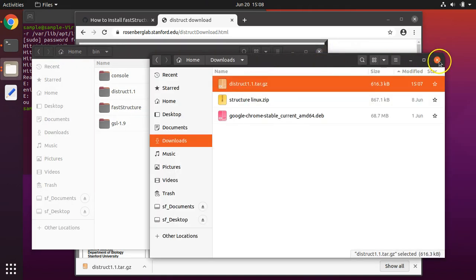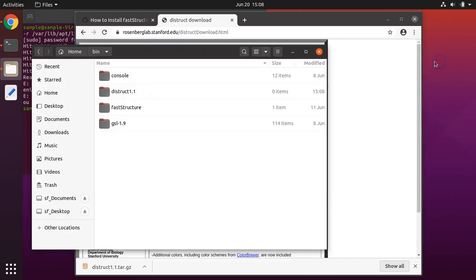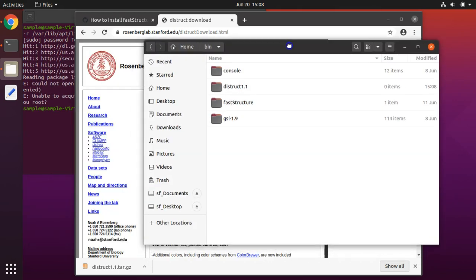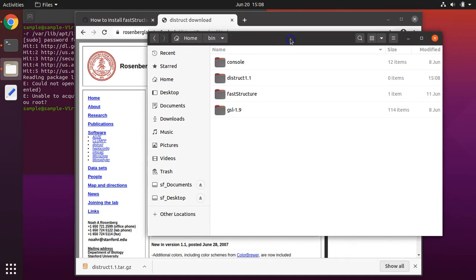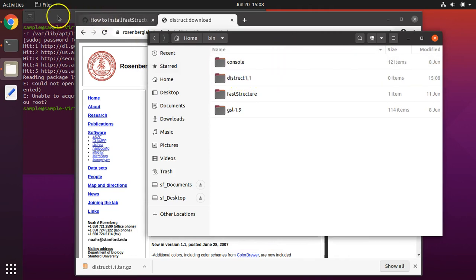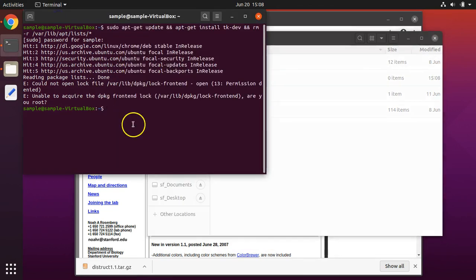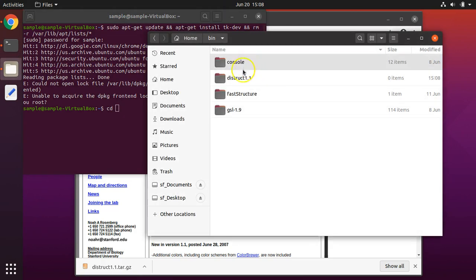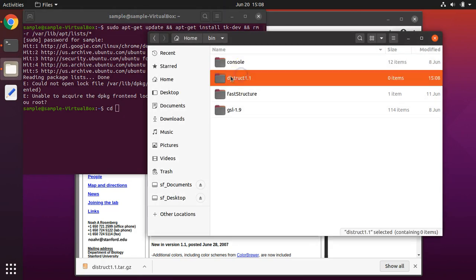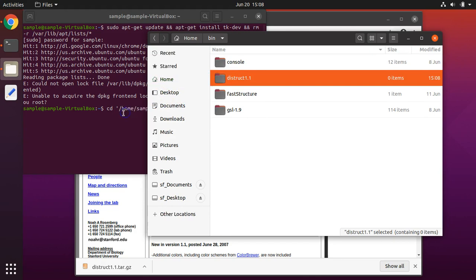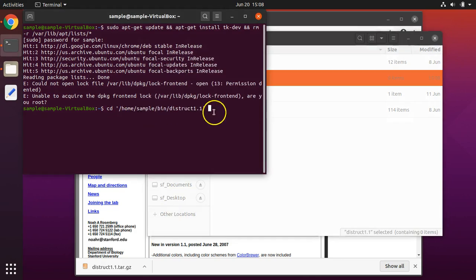And you can also close your downloads folder. To run DISTRUCT, we need to go into the DISTRUCT folder. To do that, in terminal, type cd space and then drag the folder into your terminal. And hit enter.